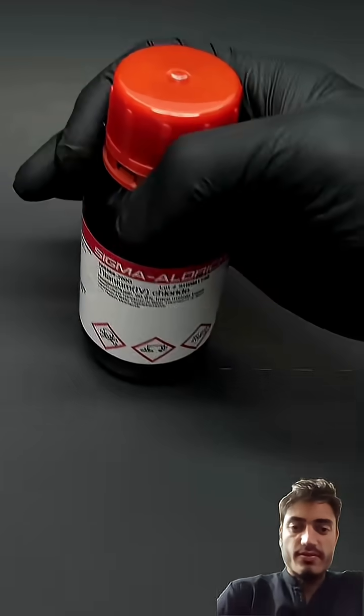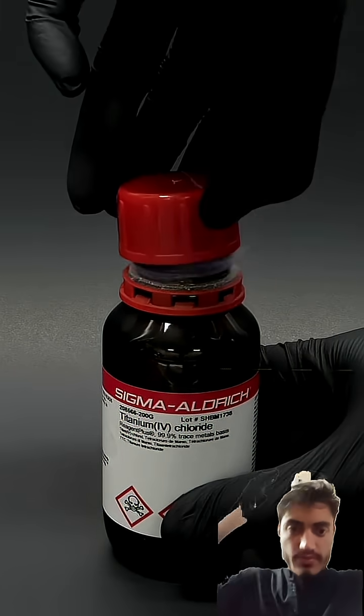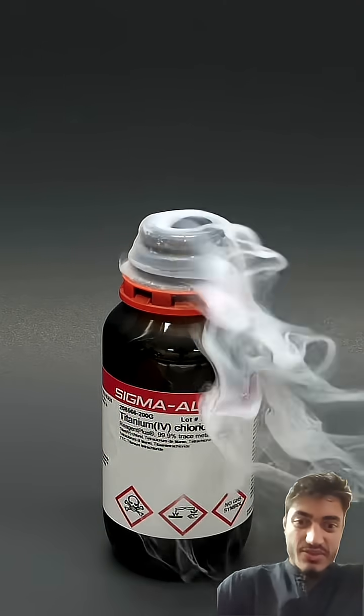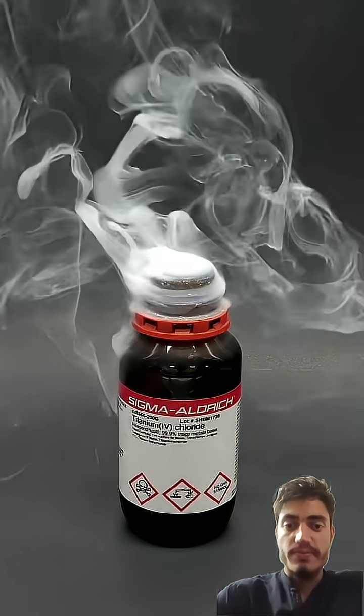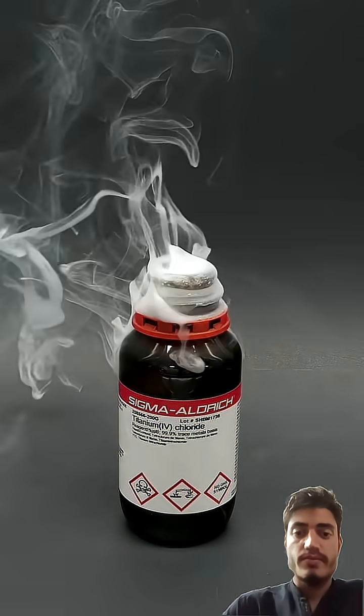So now I finally feel ready to crack it open, and I for sure have to do it in my fume hood. Almost immediately, a bunch of white smoke started pouring out. This is a mixture of hydrochloric acid and titanium oxides, which form as the titanium tetrachloride reacts with oxygen and moisture in the air.